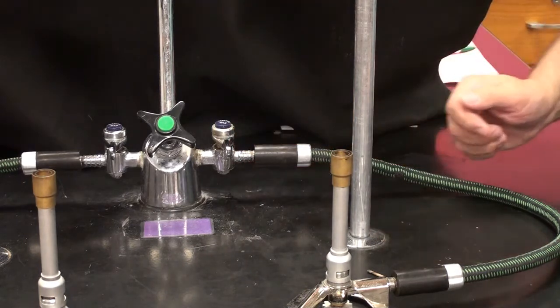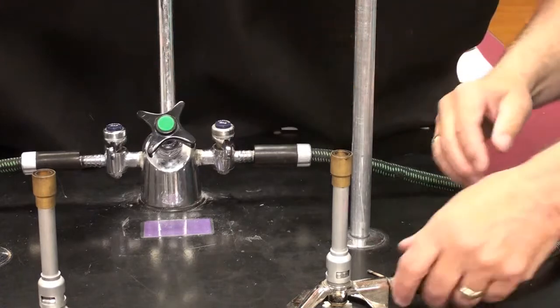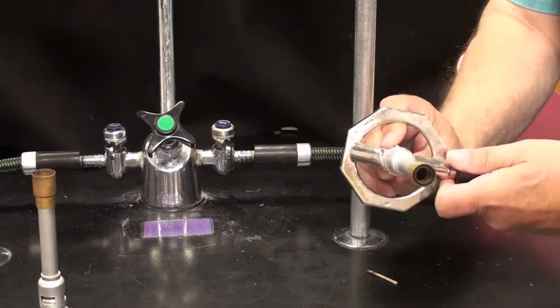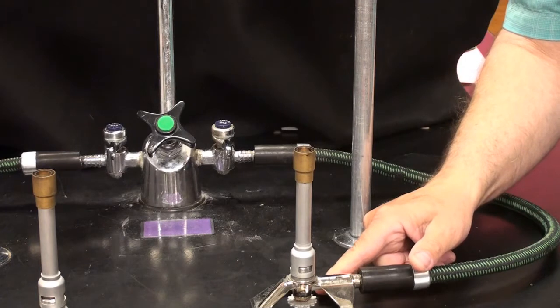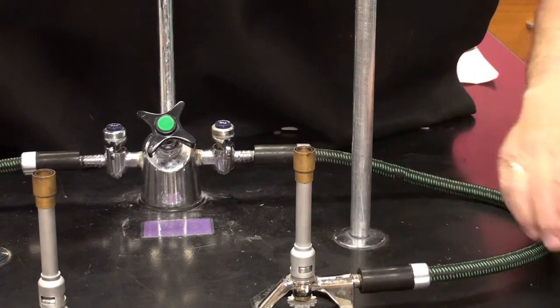So what I do when I want to light the Bunsen burner is I make sure that all those are off, double check, make sure that this is open two or three times. The reason I do this two or three times is some students accidentally open it way, way, way up and open it too far. So two or three times is really good.